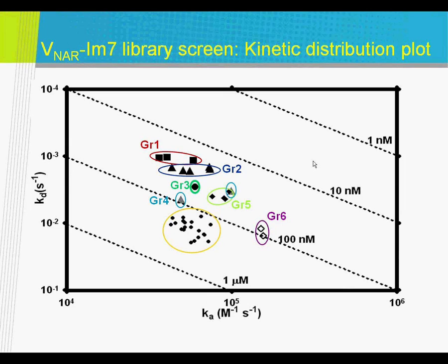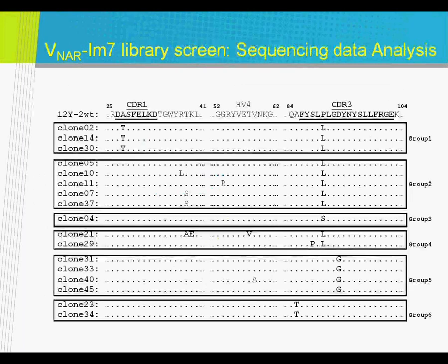The mutation was located outside of the CDR3, but just outside, in this alanine to threonine mutation. And if you look at your kinetic profile, that mutation doesn't seem to be affecting the dissociation rate constant as much. It's equivalent to wild type, but it's affecting the association rate constant. And I think the difference is about twofold.